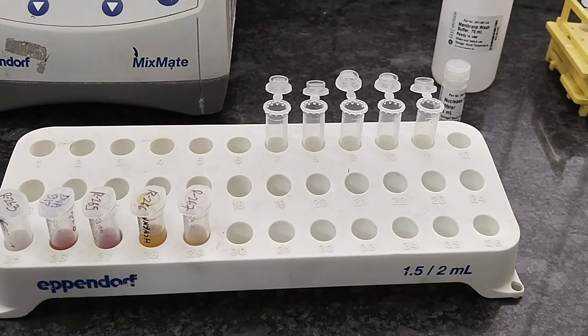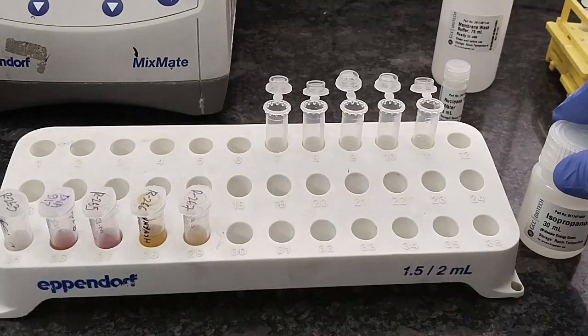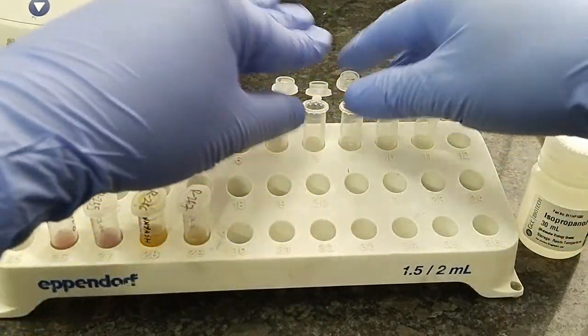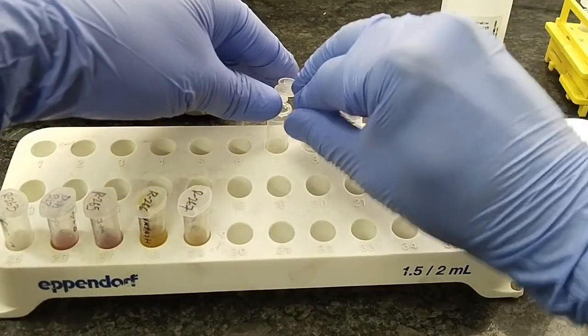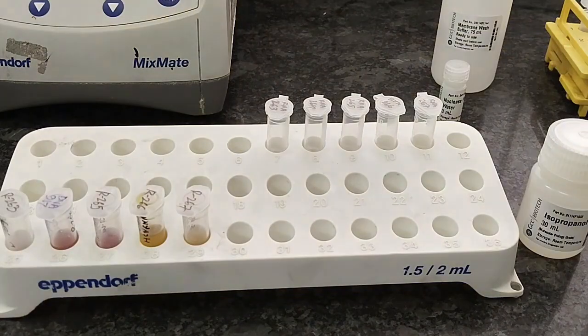So I have added isopropanol, then vortex. We need to vortex the tube so that the alcohol mixes with the aqueous part very well.